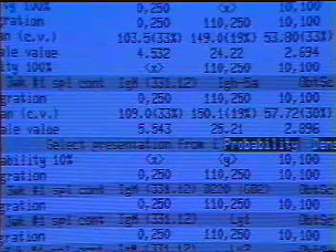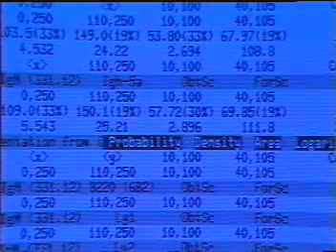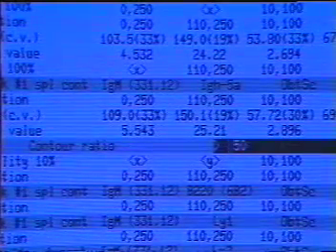Watch the screen now as we request a contour map. We enter X for fluorescein, Y for Texas Red, and gates for the scatter channels. Pressing Tab advances to the first optional prompt. Using the word right key, we position the cursor next to the logarithmic option and press Tab again. The secretary prompts us to enter a contour ratio.